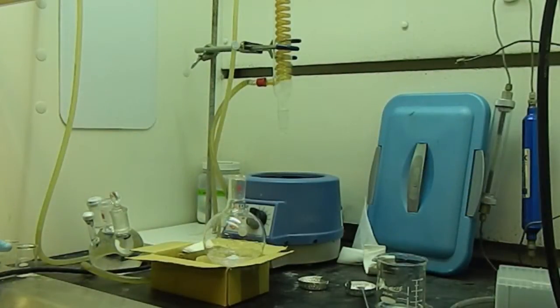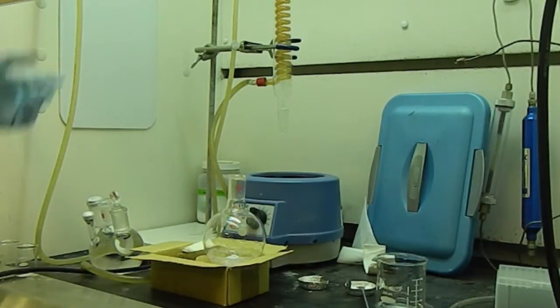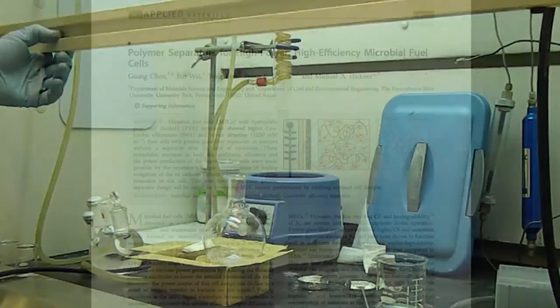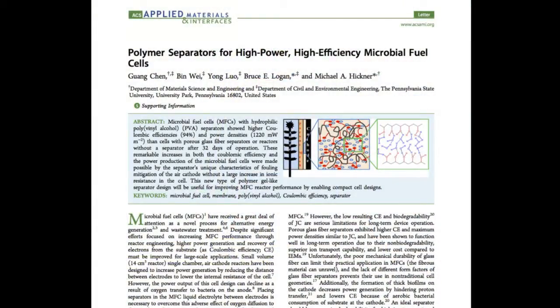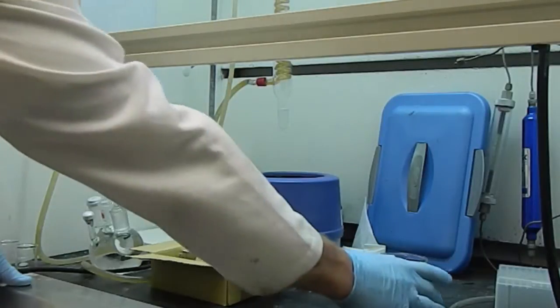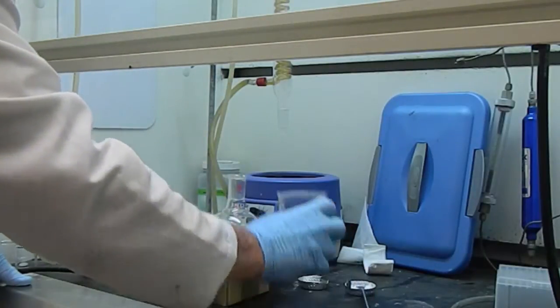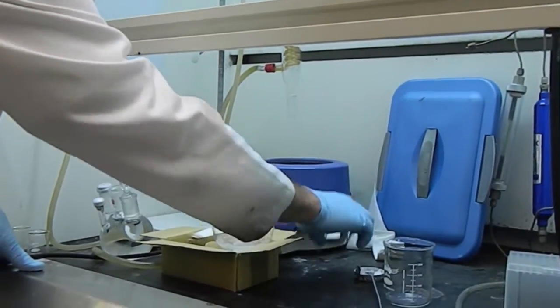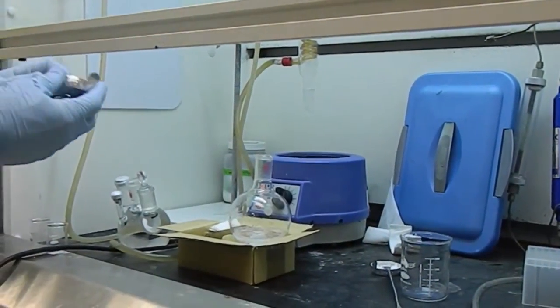Okay, so here we're going to prepare our solution. We're making an 8% PVA solution as outlined in Dr. Guang Chen's paper from 2012 on PVA and MFCs. I've measured out my ingredients already and we're going to have our water, then we're going to add our PVA to it.